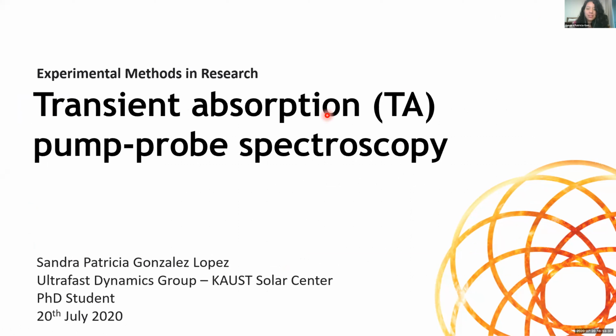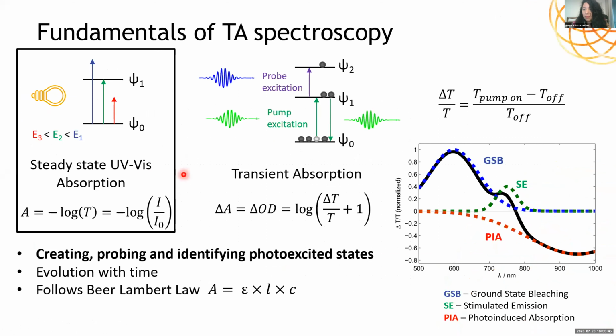So I will talk to you about a spectroscopy technique called transient absorption. I'm a PhD student in Solar Center, and this is one of the pieces of equipment that we have in our lab. A lot of you might be familiar with the steady state UV-Vis absorption technique.